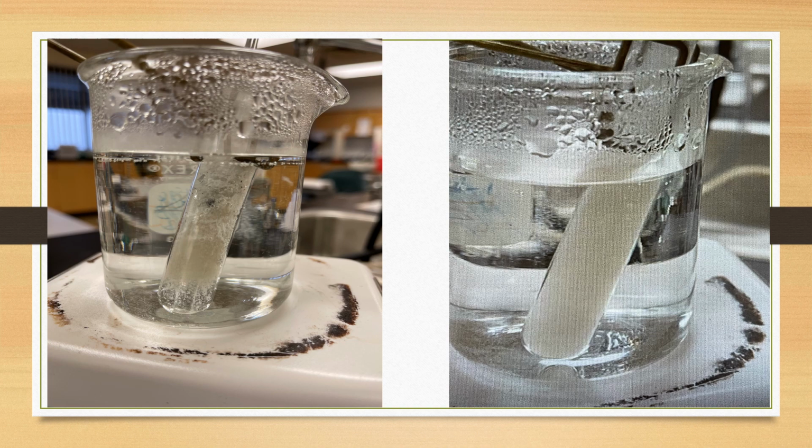Return the test tube to the hot water bath and warm it for another 5 to 10 minutes or until all the solids have dissolved. Stir occasionally. Besides water, the reaction mixture now contains a slight excess of the sulfuric acid.